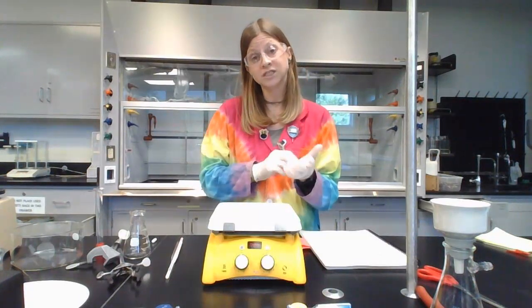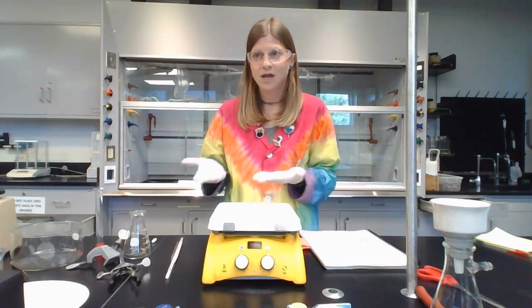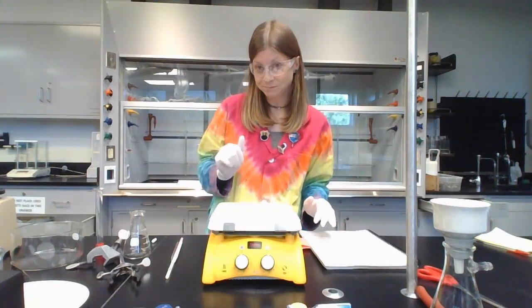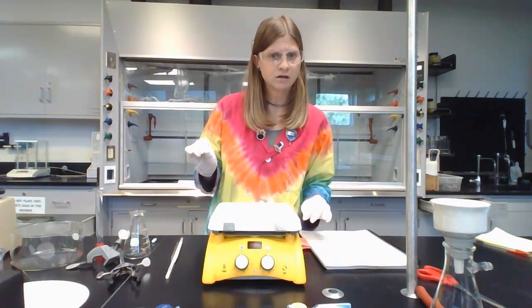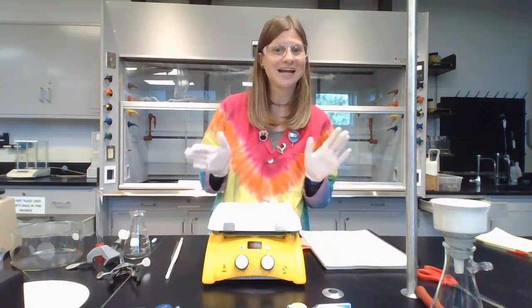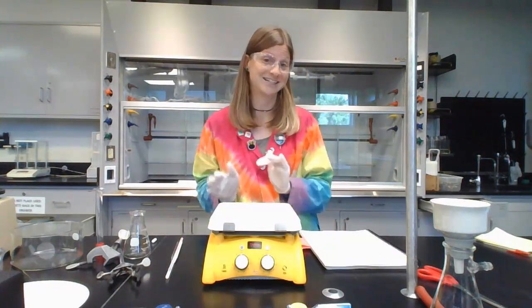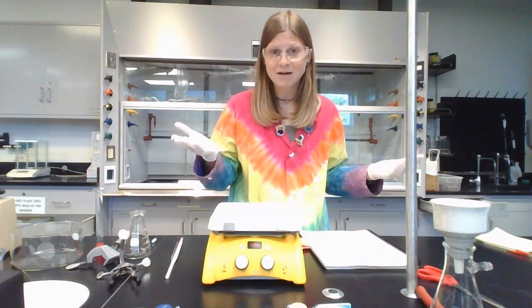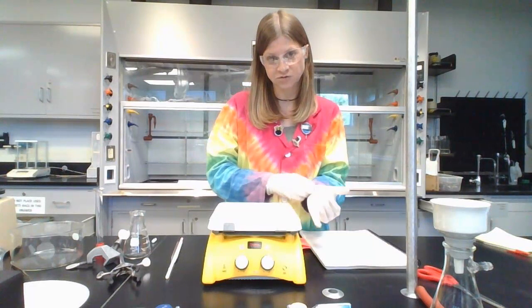So we're going to do two different types of tests. This is a really common thing for organic chemists because, again, you can't tell. Sometimes when things are really exciting, you turn a clear, colorless liquid into a maybe slightly yellow clear liquid, and that slightly yellow is probably an impurity and not supposed to be there anyway. We're sticking in the solid world for this lab, but sometimes organic chemists turn liquids into other liquids. So we do tests at the end because you cannot see visibly whether or not you were successful.